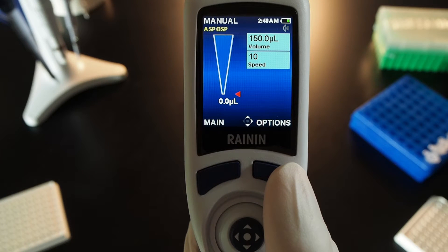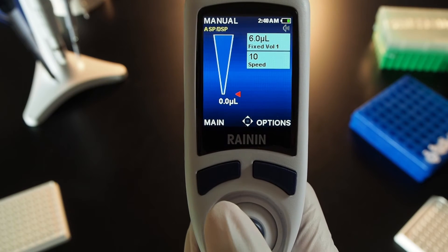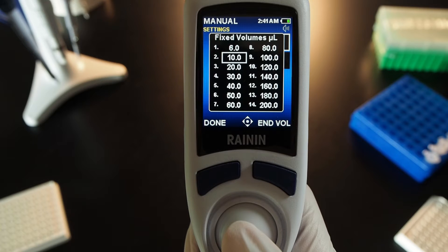To set and use fixed volumes, press the button on the right for options. Press the joystick in to turn fixed volumes on — it will turn green — then push done on the left. Move the joystick right to go into settings and press the joystick in to open a list of fixed volumes.